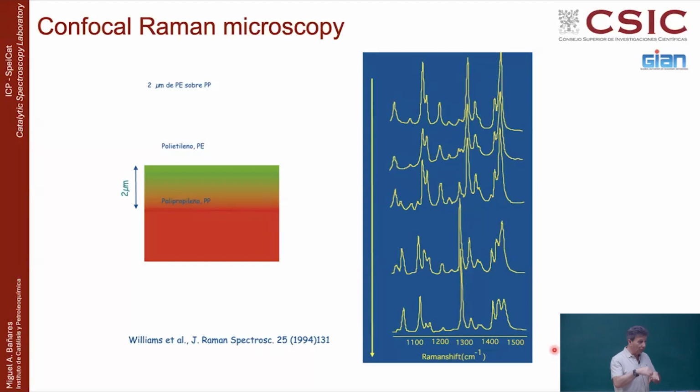If you cut it and look from the side, of course, you will get the same thing much faster, because one problem of confocality is that total intensity decreases. Usually when you are using the microscope and you focus here, you get this volume around it into your spectrometer. By doing confocality, the volume around the focal point is minimized, because anything above or below the focal point is cancelled. The volume you probe is the same, but the volume that gets to the detector is filtered by the pinhole.